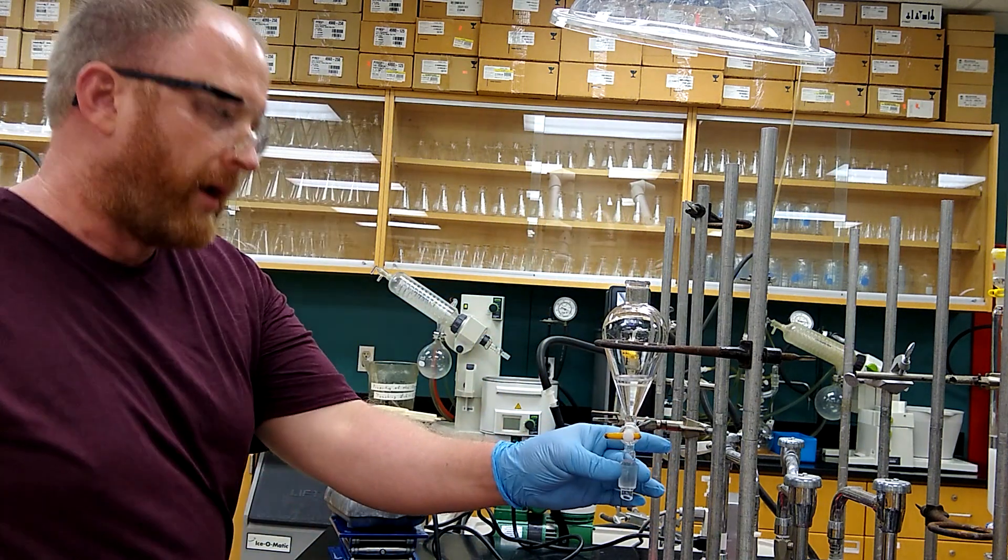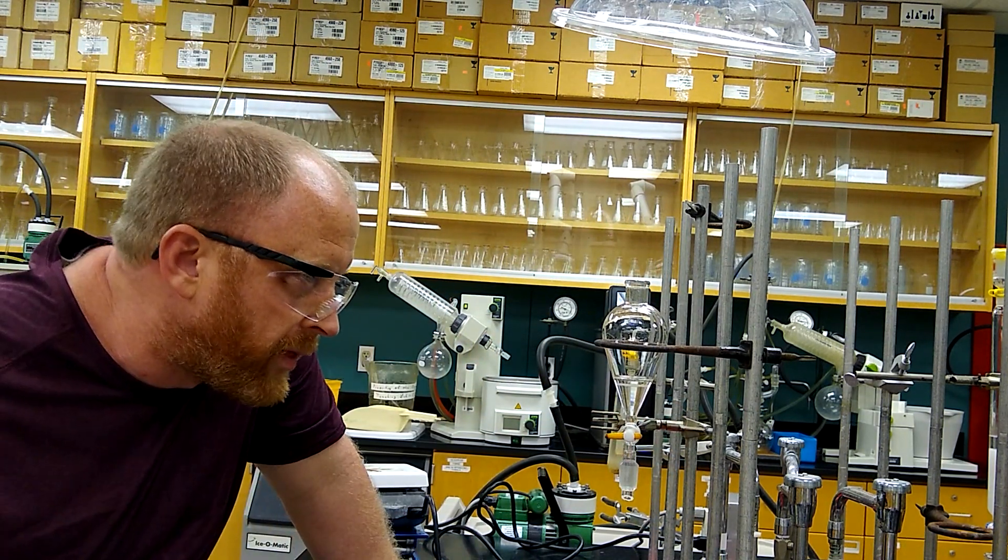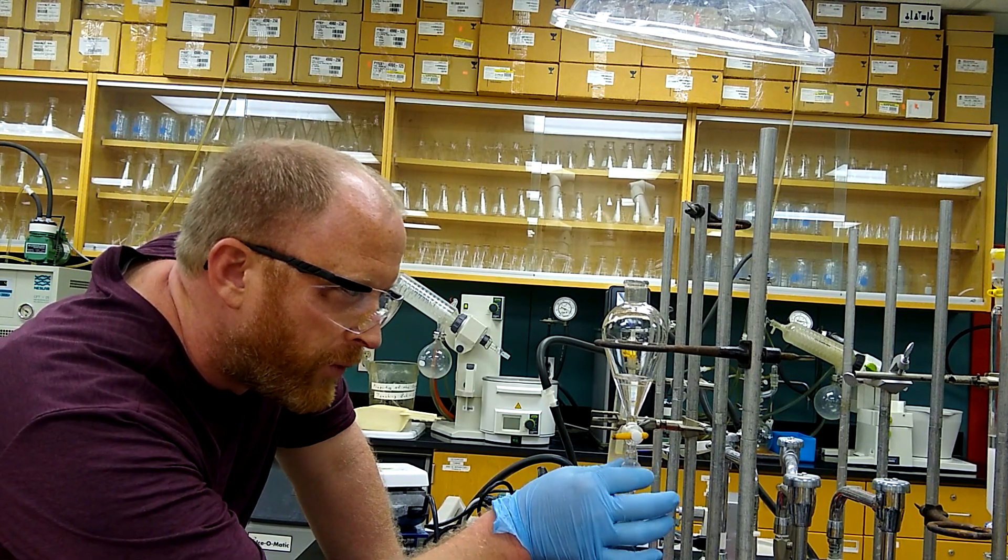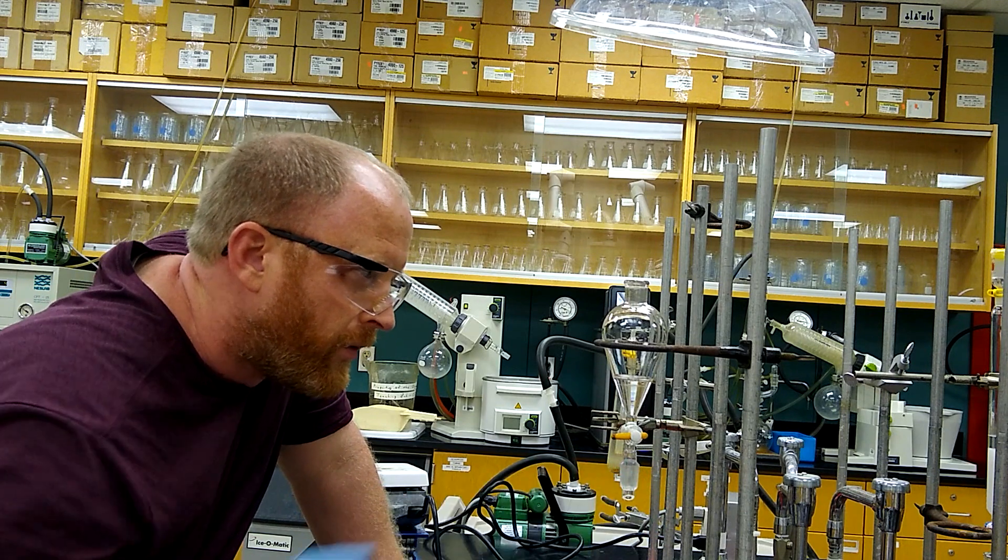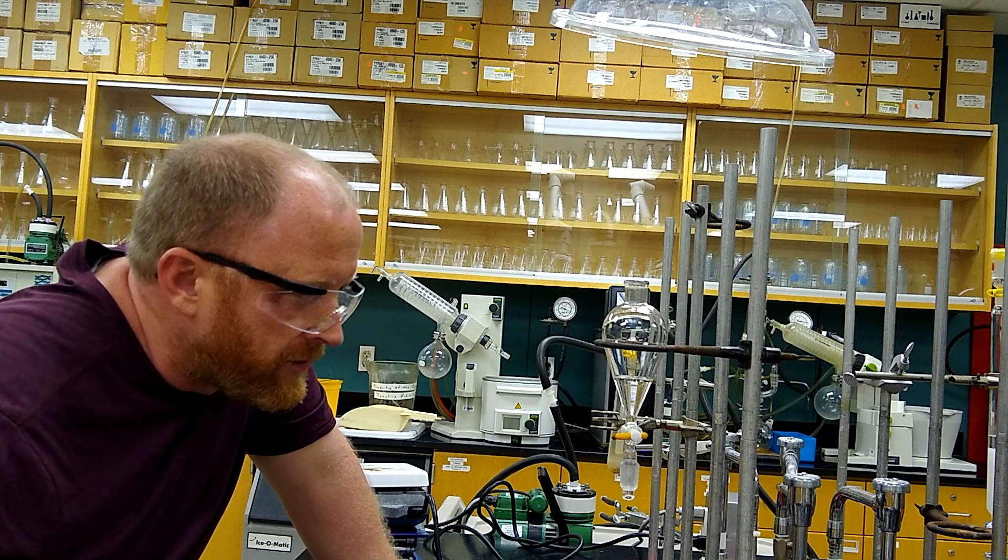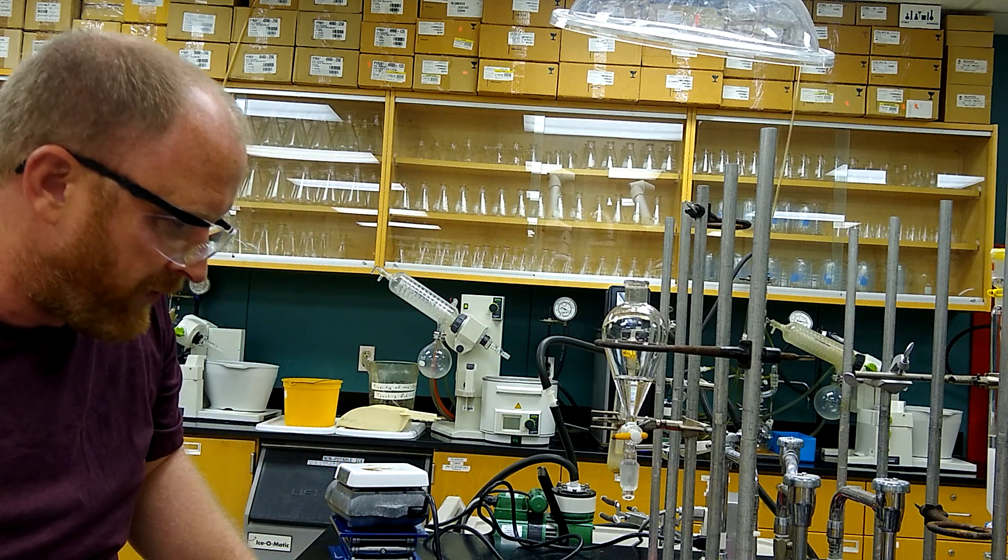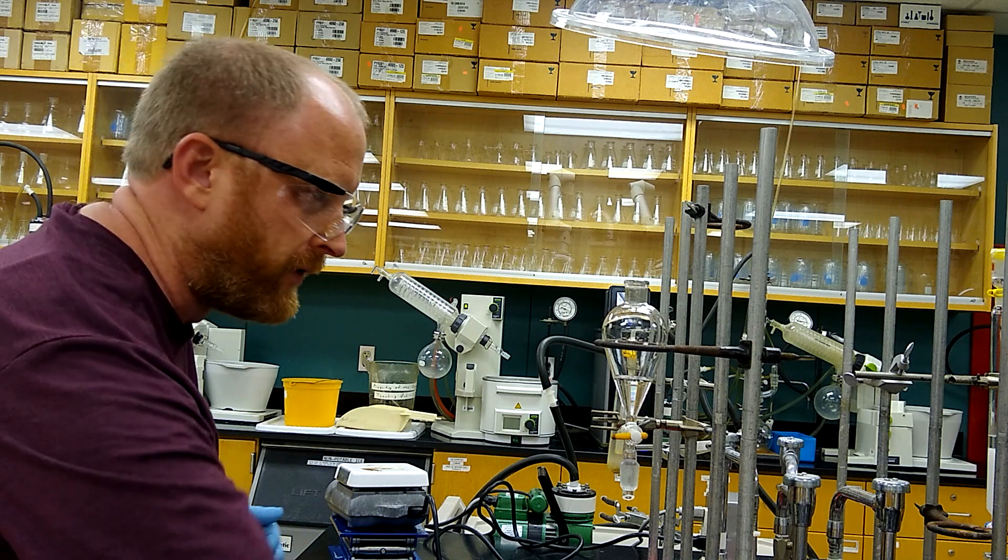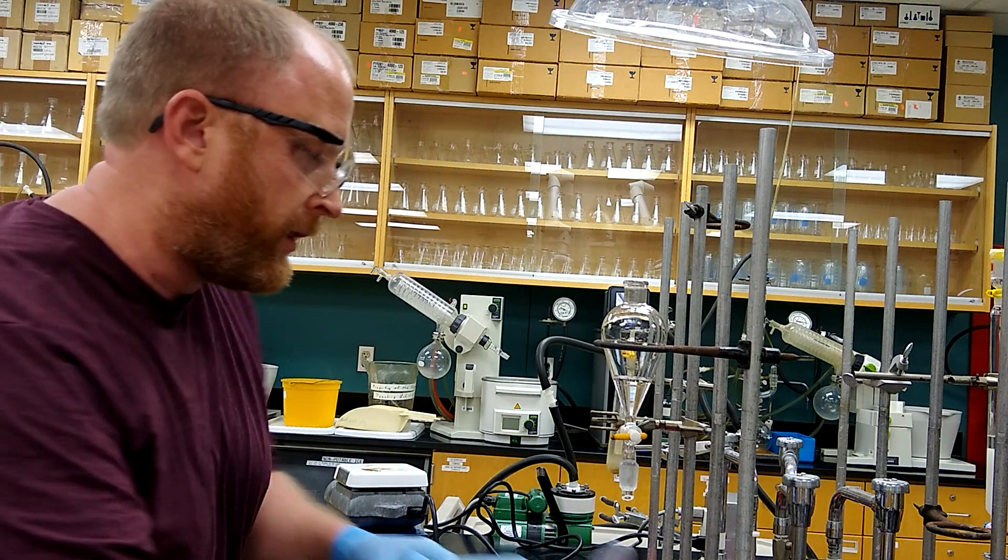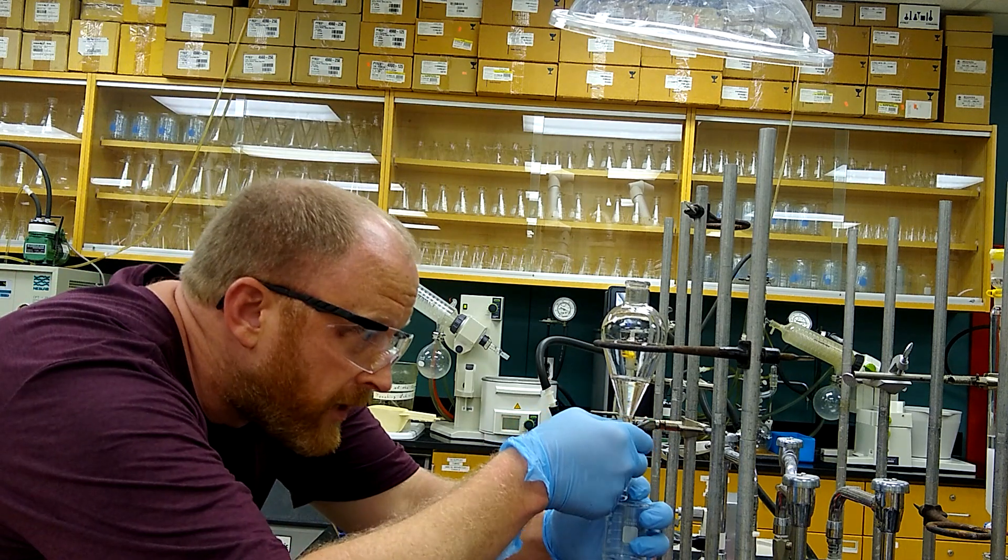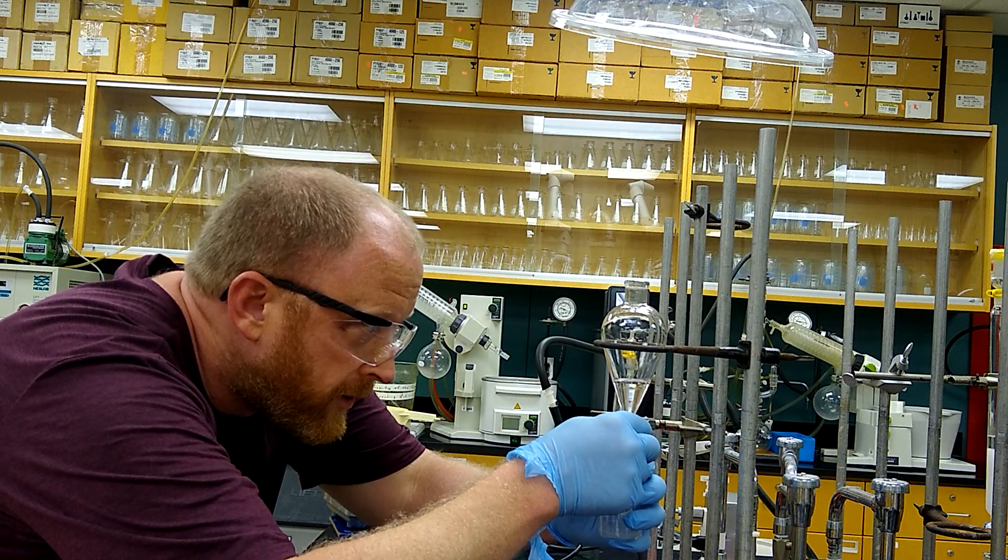If you'll remember, because the density of ether is less than the density of water, which is 1 gram per milliliter, the ether layer will be on top. I just gave that a second to separate, and then we'll drain that off into another flask. Right now I'm just draining the aqueous layer off into a beaker.